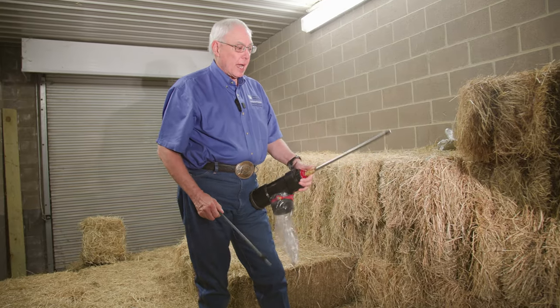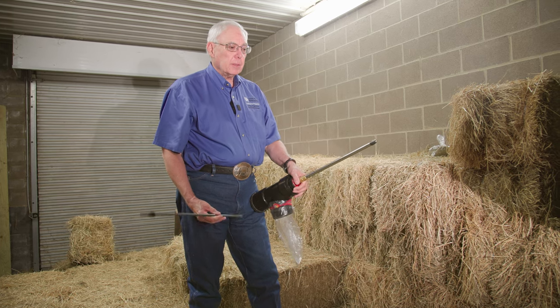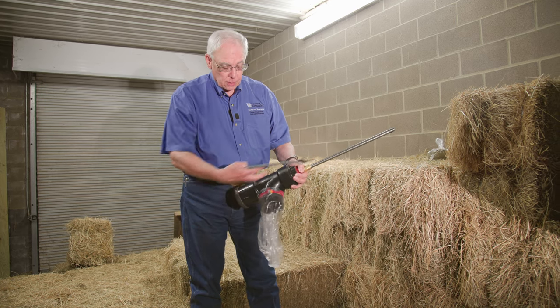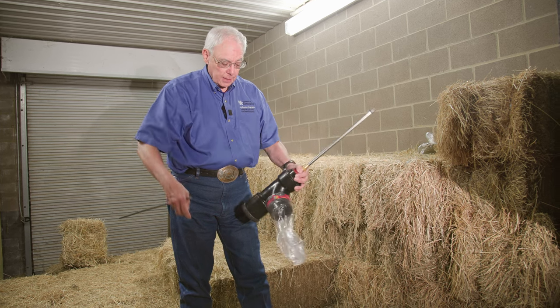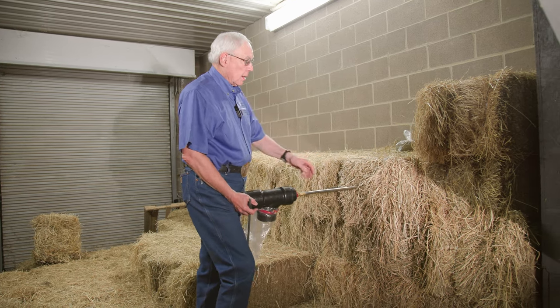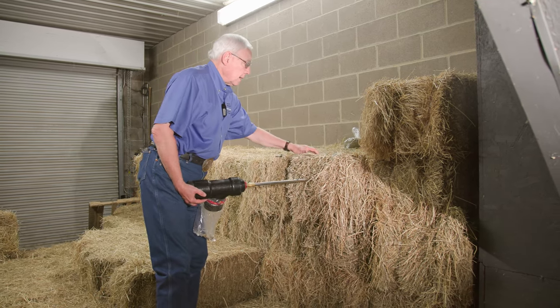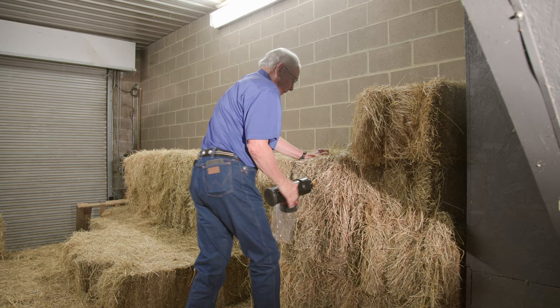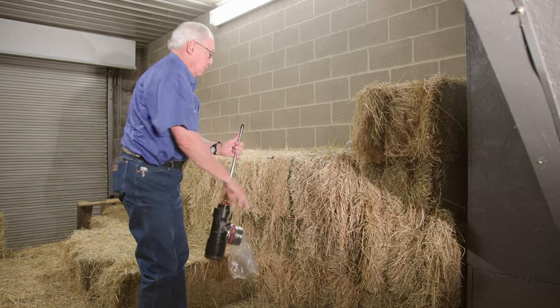This is the hay probe that I use, and I like it because I don't have to have a drill and I can use it pretty much any time. It has a cutting tip on it and a whole tube to collect the sample. After I put it into a bale, I'm going to push down just to clear the tube and have the hay fall into the bag. On square bales, you want to go at the end between the strings, and with this one I like it because I can just push it in.